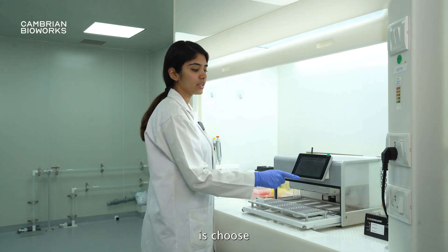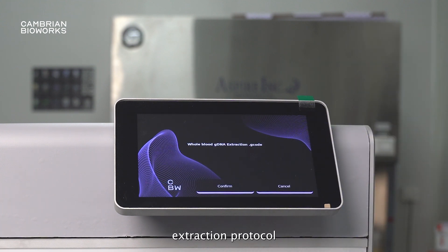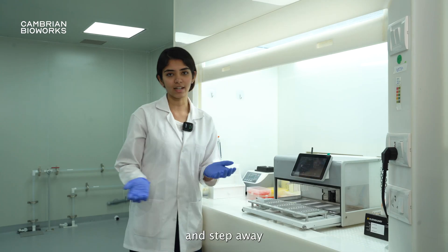Now, all you have to do is choose your extraction protocol. In this case, we will be choosing the extraction protocol for blood, confirm the run, and step away.